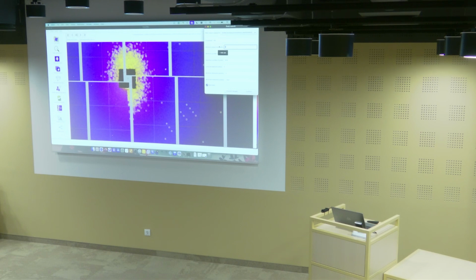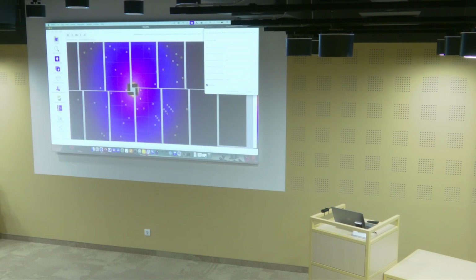That's the reason why, even if you're very familiar with CrystFEL and you like to do everything on the command line, it's very good to open your images and see what you're actually doing. So we can go back to maybe a value of 5 to have something much nicer. And this seems to be fine for this image.